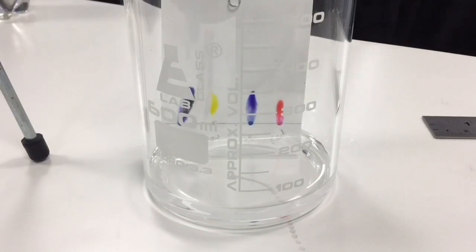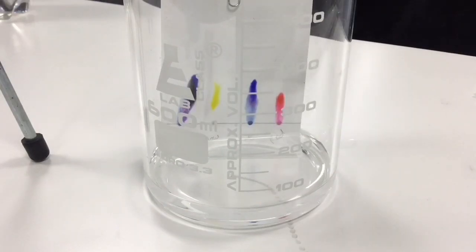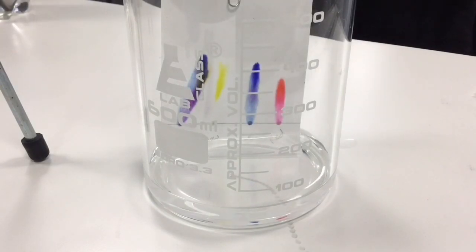Once the paper is placed into the solvent chromatography will begin. It is vital that the solvent does not pass the point at which the inks were placed on the origin line as at this point the solvent would dissolve any of the soluble inks that were on the line.